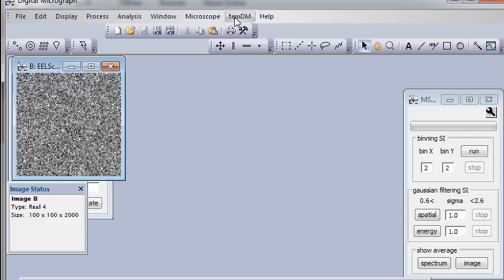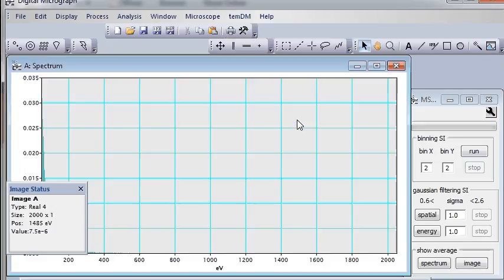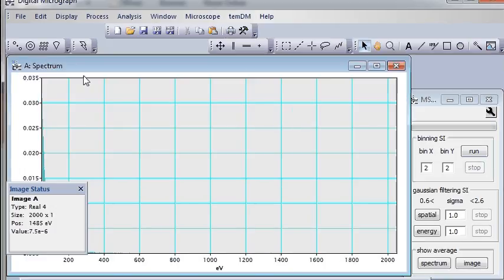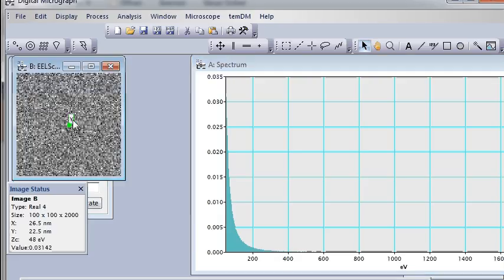Just go to TempDM, MSA, and view spectrum. Then some small green pointer will appear.